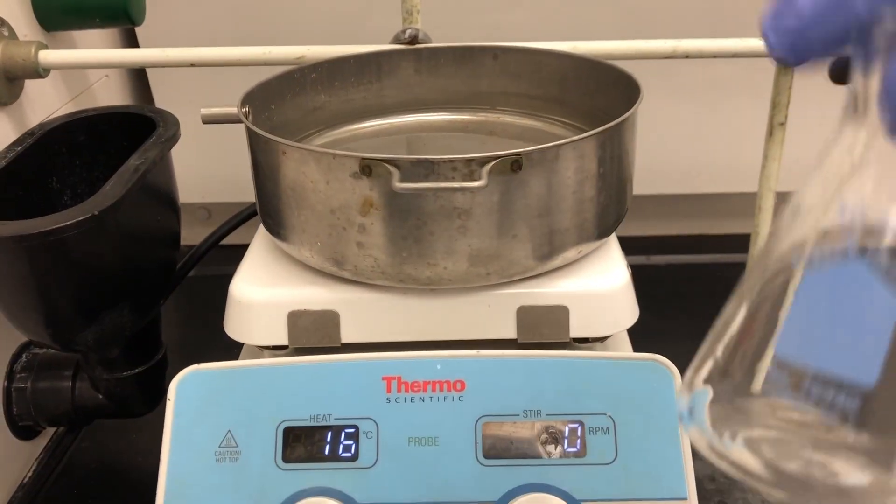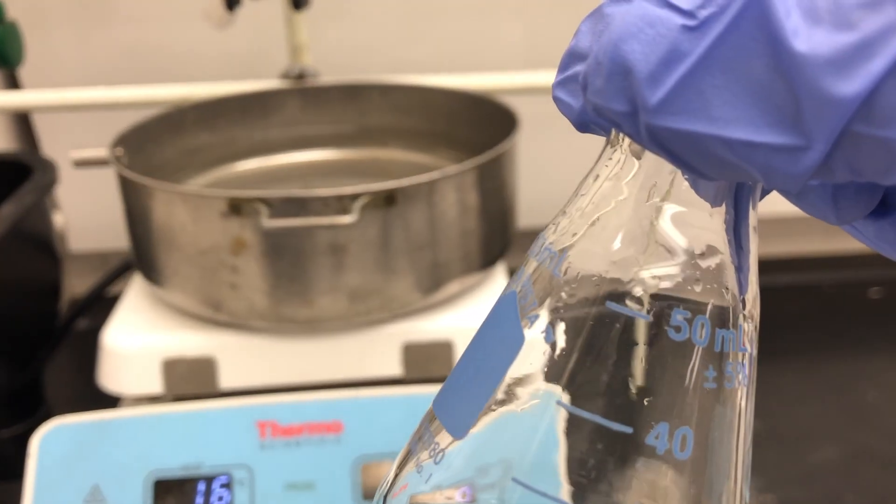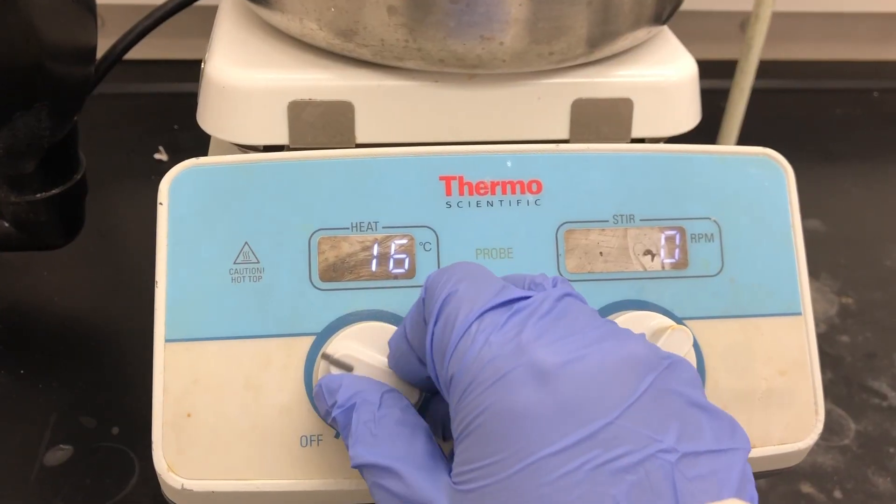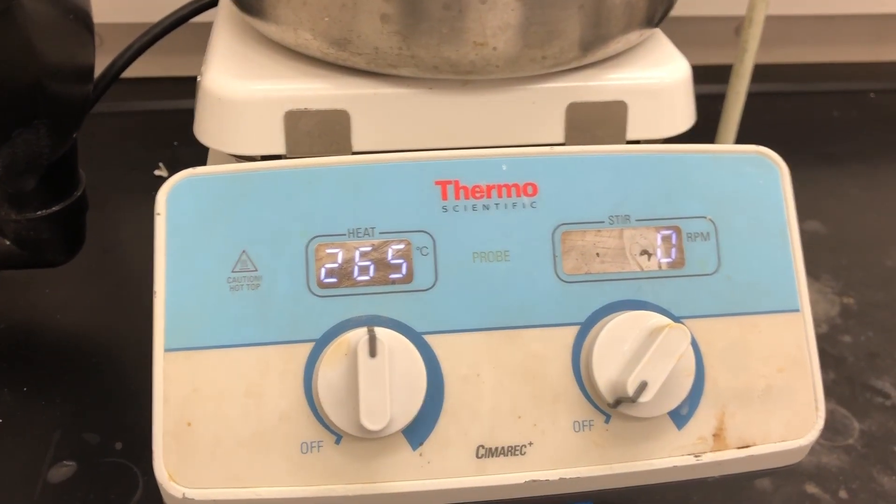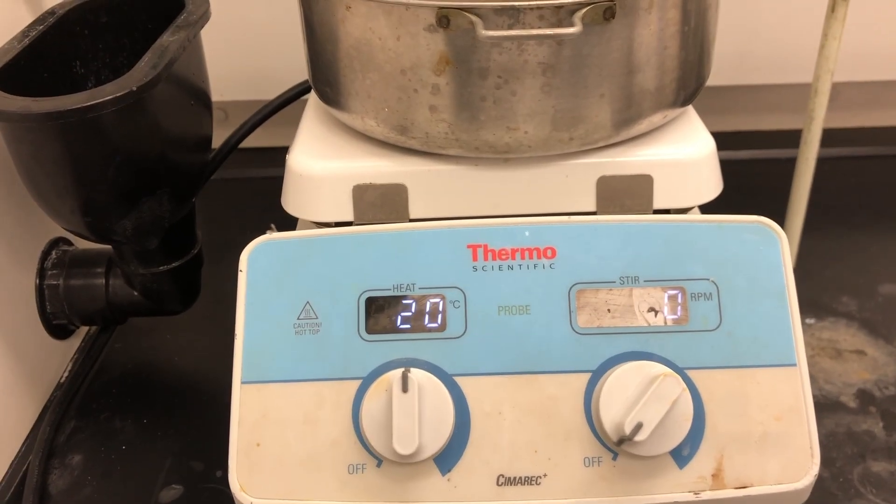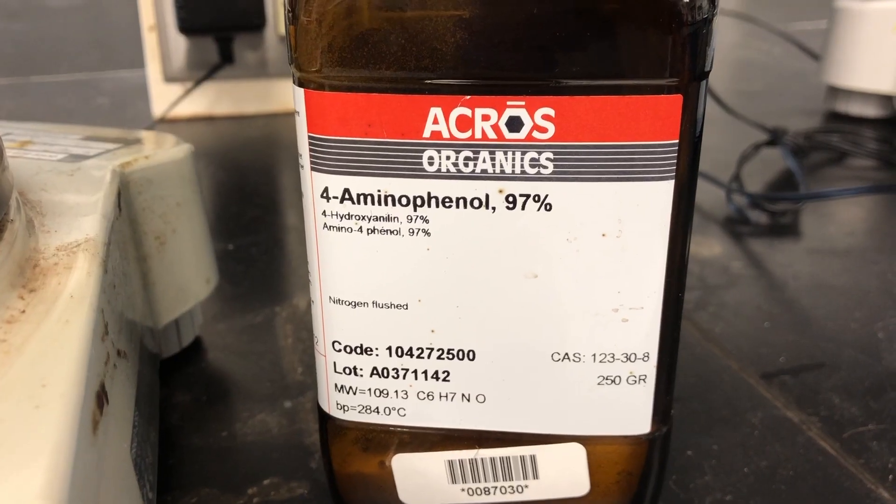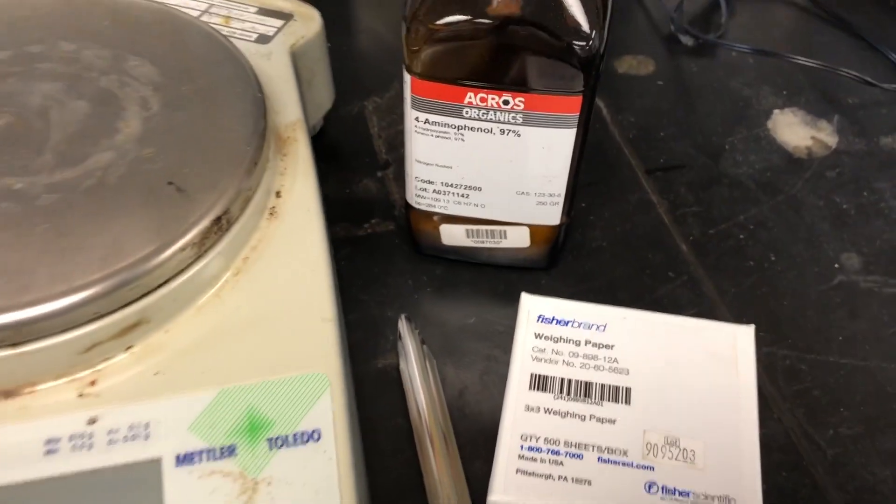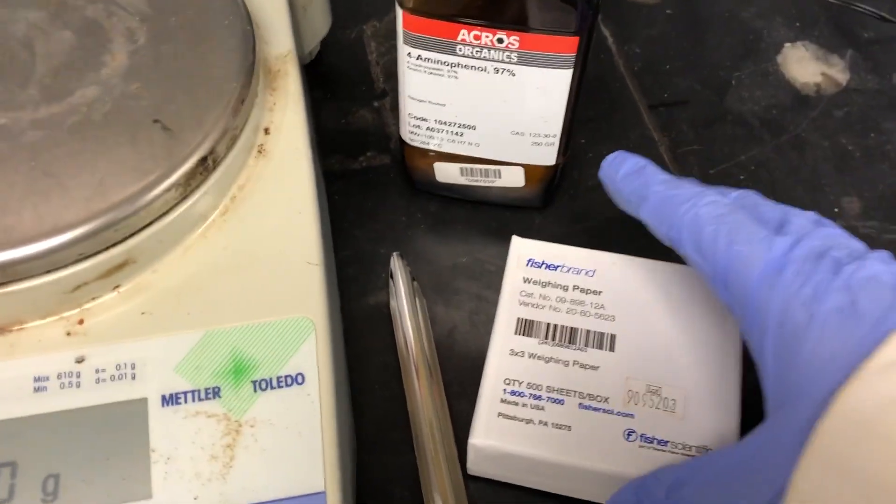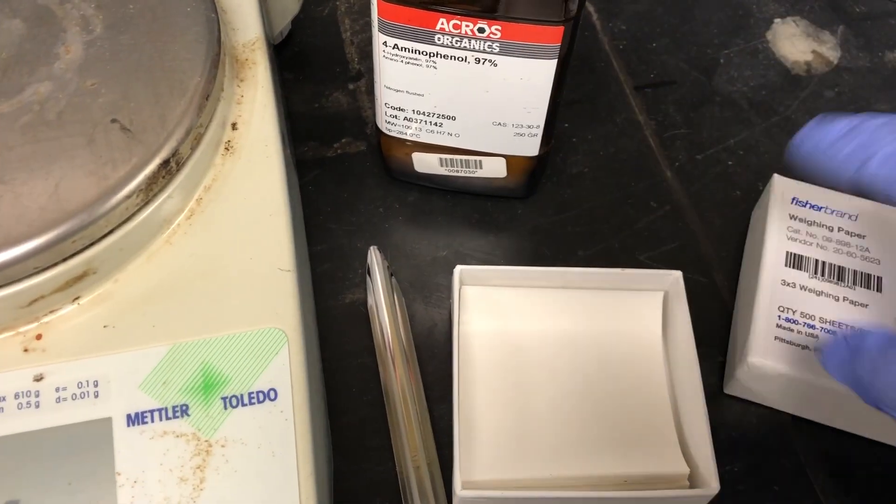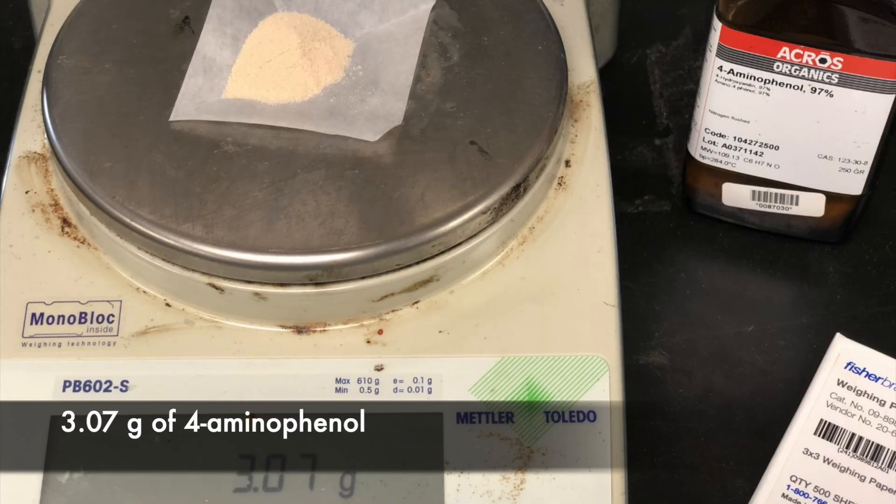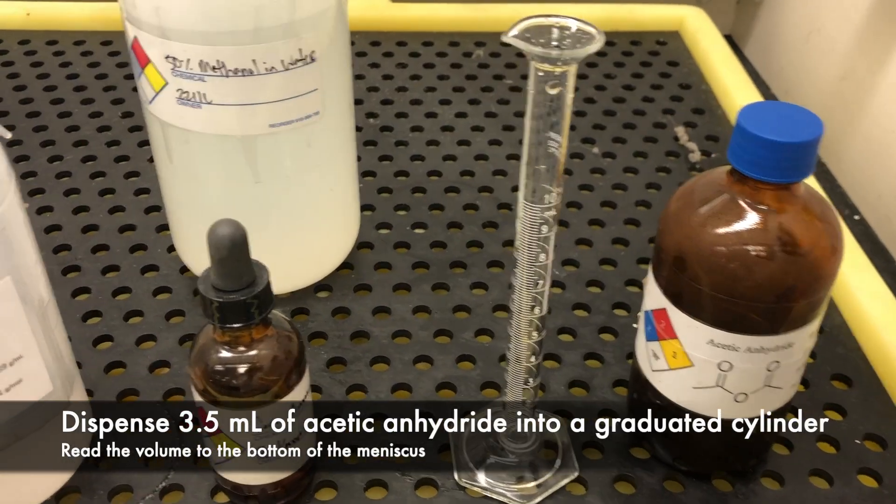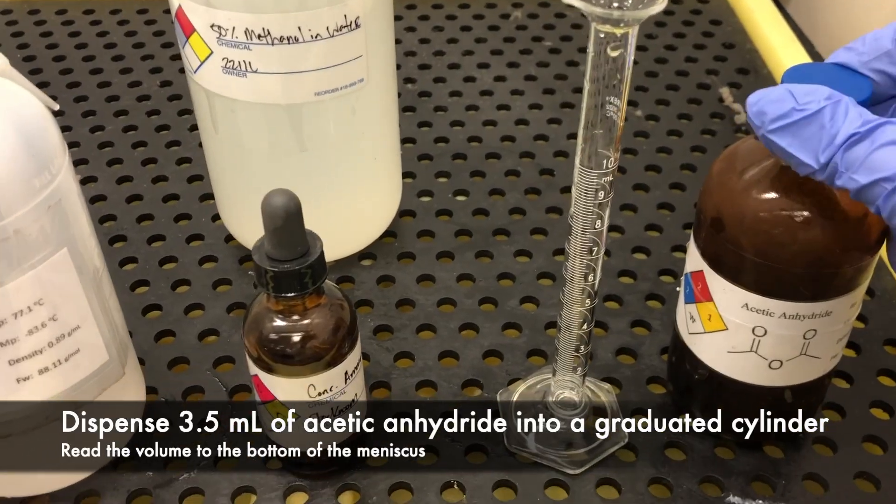I'm going to take a minute to go weigh p-aminophenol, and while we do that we'll go ahead and turn on the hot plate. P-aminophenol is one of our two starting materials. We're going to weigh around three grams using weighing paper.